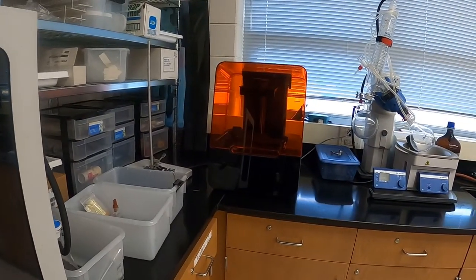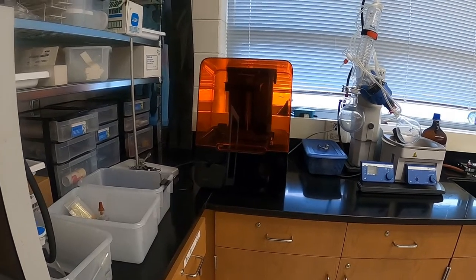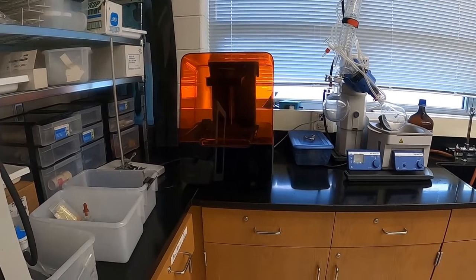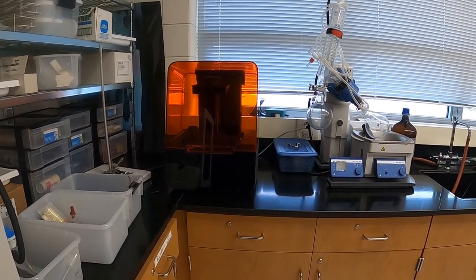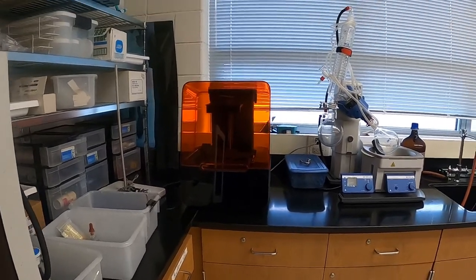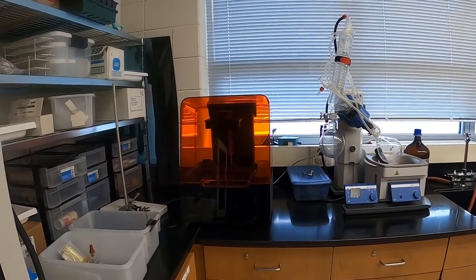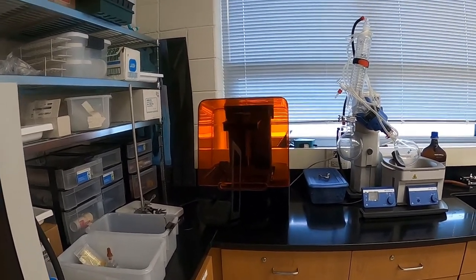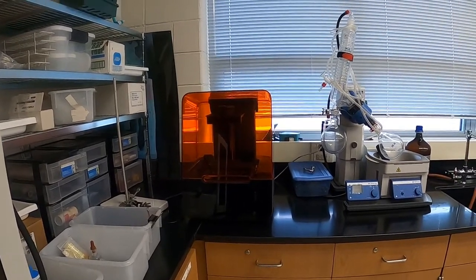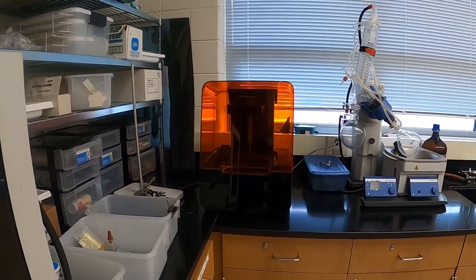We also have what's called a Form 3 3D printer. So students have used this to nanofabricate or 3D print small apparatus or devices to go with their projects. Some other applications I'll talk about later include the 3D printing of microfluidic devices for miniature reaction chambers. And on the right there, we have what's called a rotovap for doing distillation of organic solvents from products.